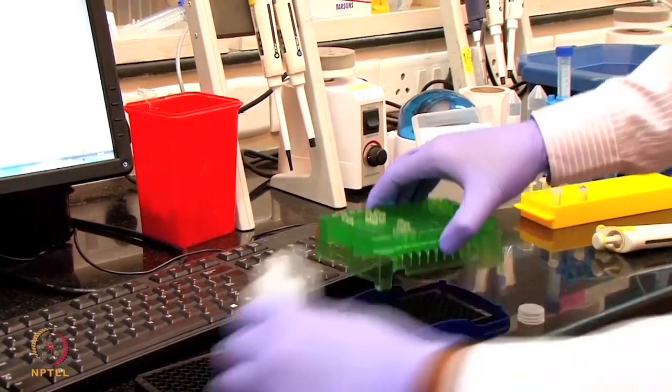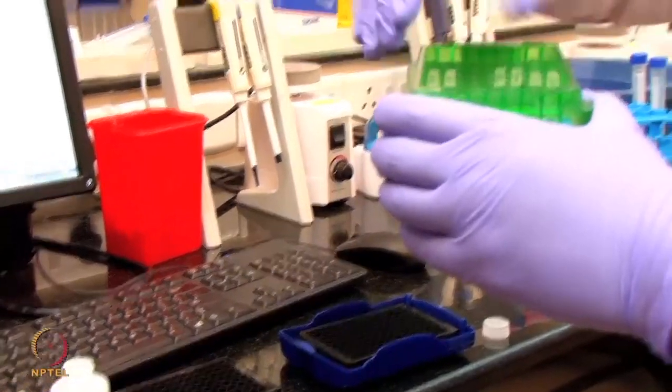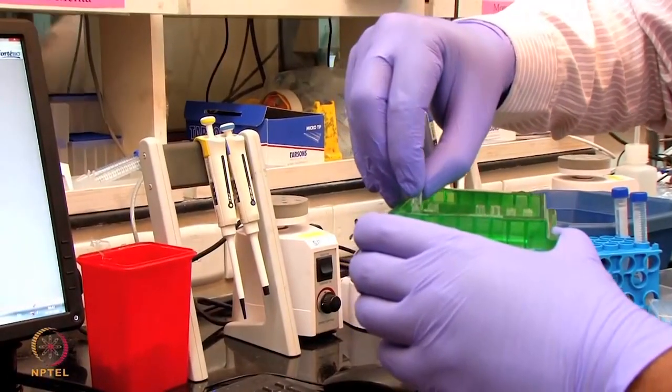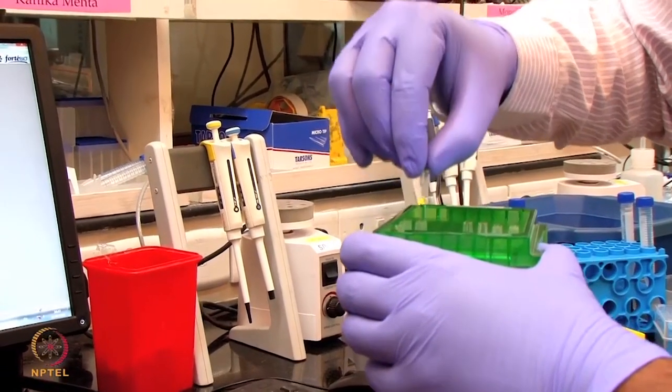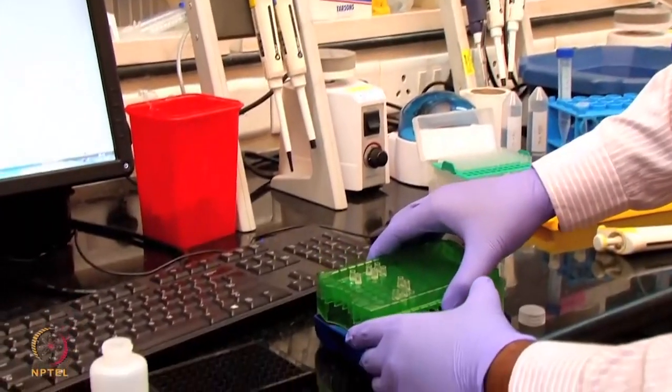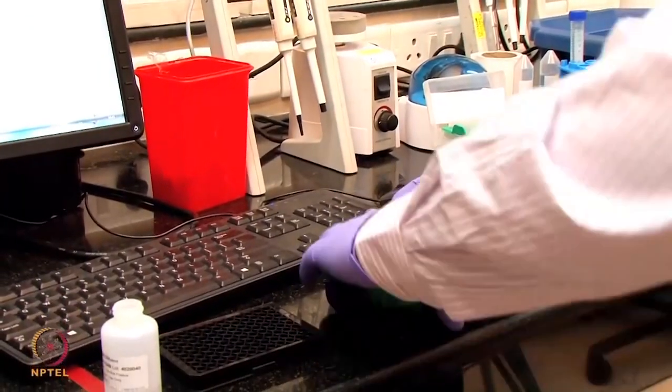So now the sensor position I'm changing from A1 B1 to A2 B2. So now I will start the equilibration of the sensor with this particular buffer. We are going to do a quantitation of the apolipoprotein. In the previous step, we immobilized the biotinylated antibody onto the streptavidin sensor. Now we can do the quantitation using those sensors.